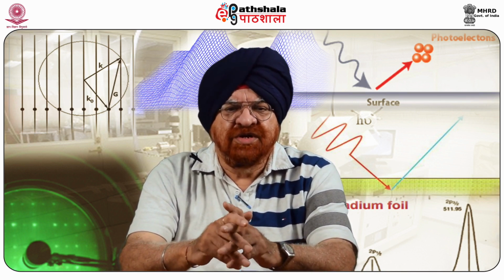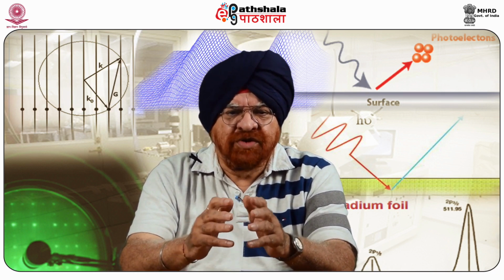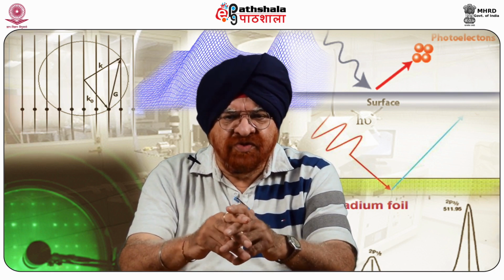Subsequent to the evaporation, the films have to be separated from the KBr substrate. For that purpose, the films are floated off in distilled water until the thin film is detached from the substrate and floats at the water surface due to the surface tension. Afterwards, a small piece of the film is mounted onto the standard electron microscopic grids, incorporated into the electron energy loss spectrometer. The sample holder is used for this purpose and is transferred into the spectrometer.